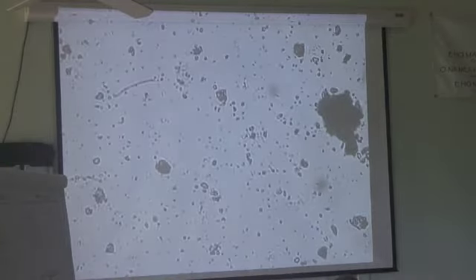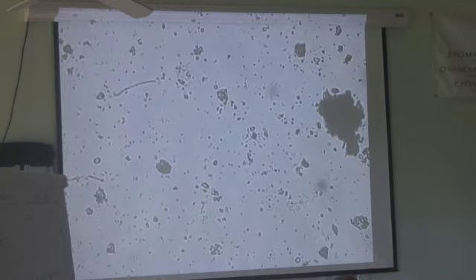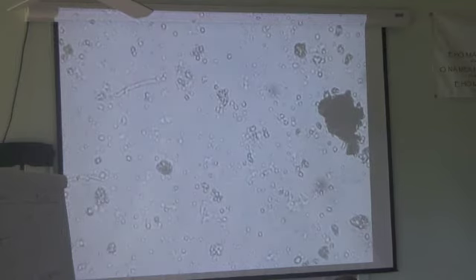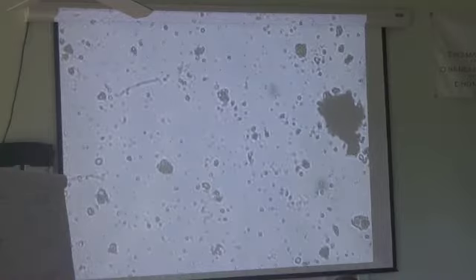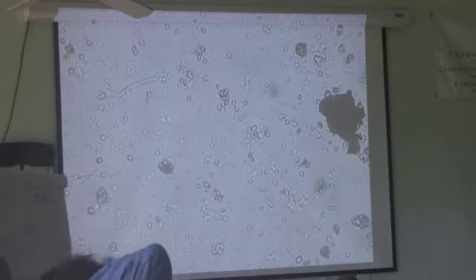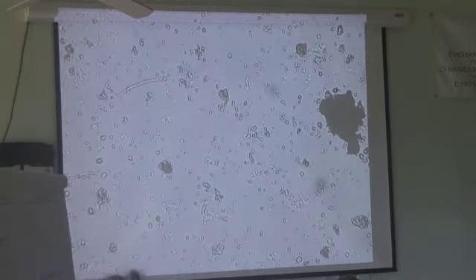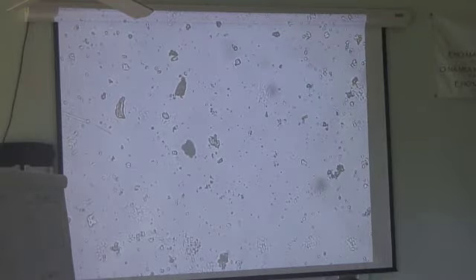So, moving over. Flagellate. Actino. And that's it. Maybe wait a few more seconds in case a flagellate or a ciliate comes rolling by. Check for oozing, maybe. Nope. So, going up. There's an actino. Ciliate.